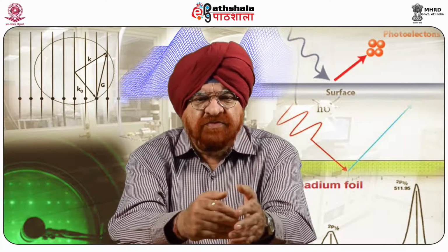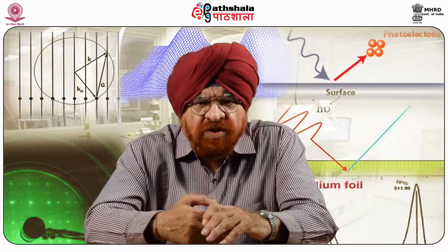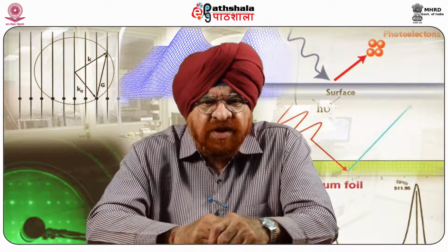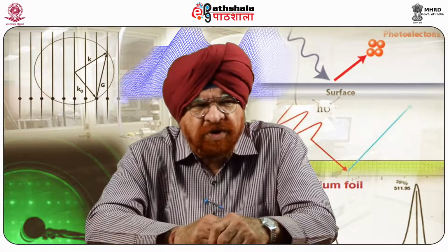The first AFM, operated in contact mode, was also started around the same time. In contact mode, the tip is mounted onto the end of a flexible cantilever and raster scans the surface of the sample.